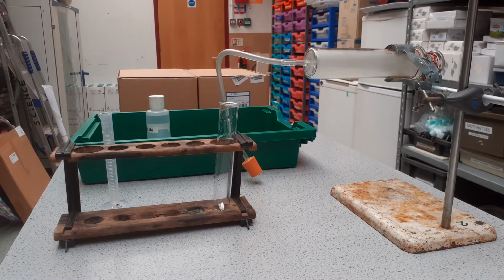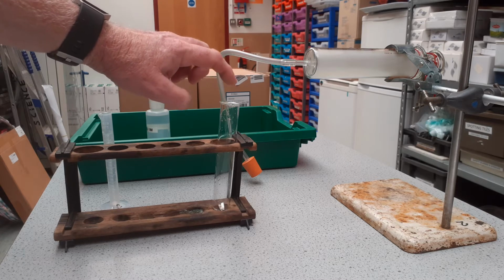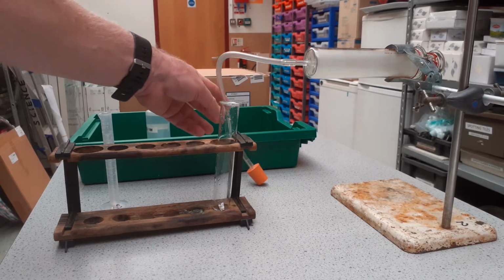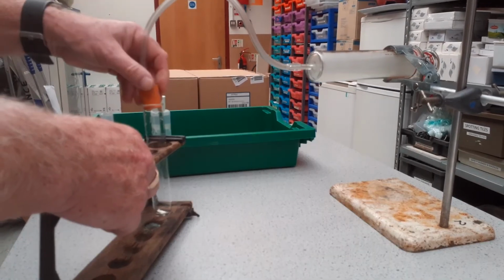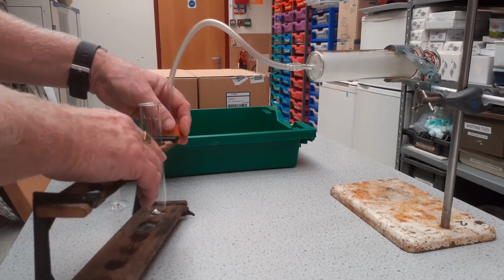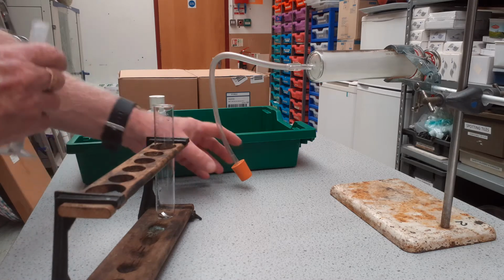This is our apparatus setup. We're going to do the reaction between the acid and the magnesium in a boiling tube. The hydrogen that's been produced will pass up through this bung into the delivery tube and will be collected in the gas syringe. The reason why we're using a gas syringe is because we can very accurately measure the volume of gas produced. So let's get started.